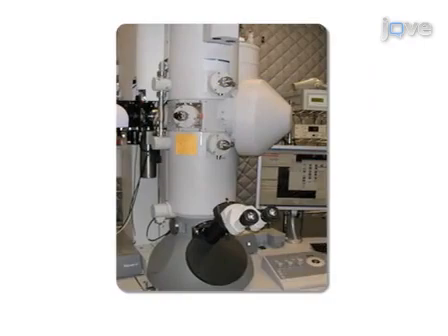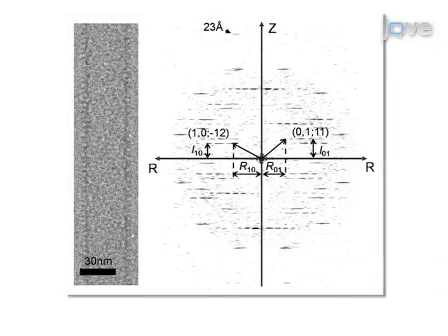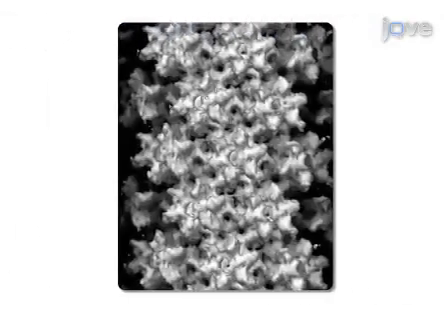This process ensures protein stability while reducing background noise and improving the signal-to-noise ratio during the cryo-EM low-dose data collection that follows. Subsequent to data collection, helical indexing of diffraction patterns is completed. Image processing is then performed, followed by real-space 3D reconstruction, resulting in the final density map of the HIV-1 capsid, or CA, tube.